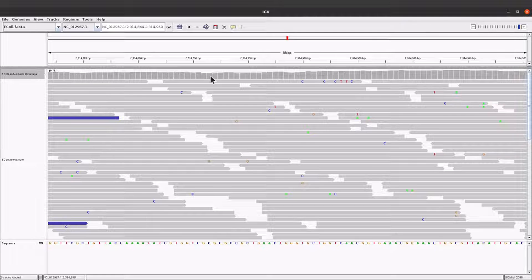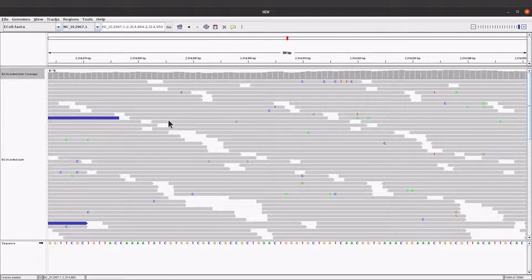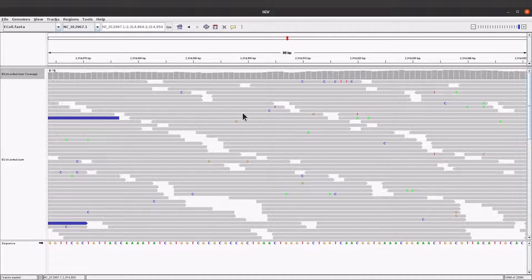On the top we have coverage information, in the middle we have the alignment records, and on this side you see the sequence - this is the reference sequence with individual bases. Now if you look at what we have here, each of these tracks represents a read. Let me use an example - each of these here is a read.